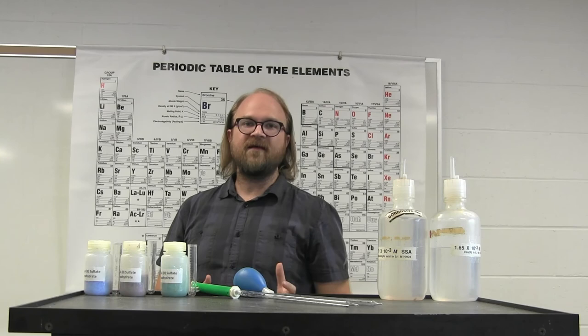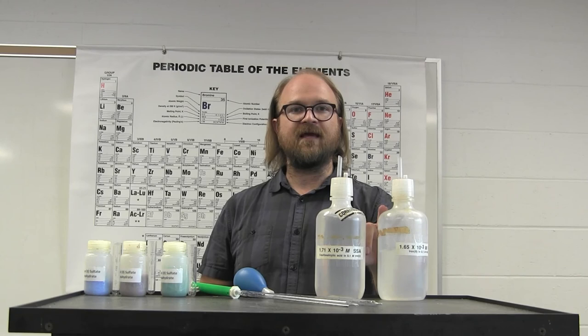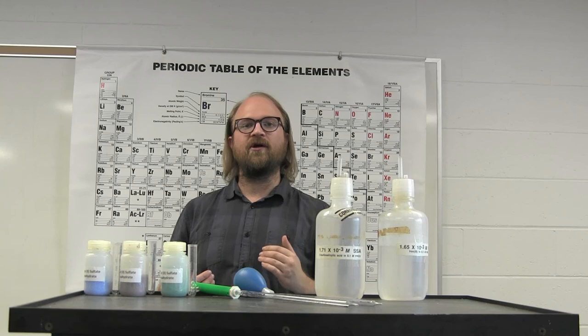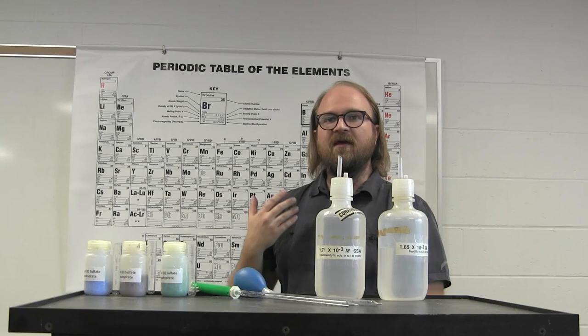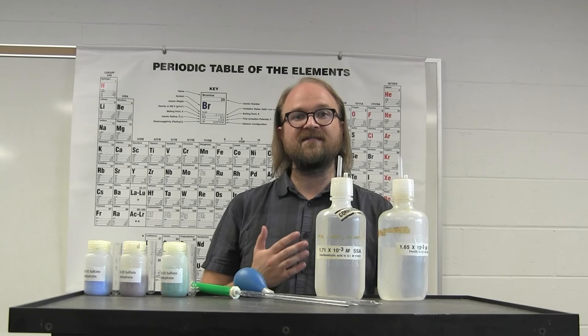So in this lab, you were looking at preparing a lot of different solutions. You took solutions of iron nitrate and sulfosalicylic acid and made different mixtures of them, looking at the ratios. And by varying that ratio, you're varying the amount of that final product. In the report, you're looking at how many moles of each material is present in each one of your diluted test tubes, each one of those combinations.